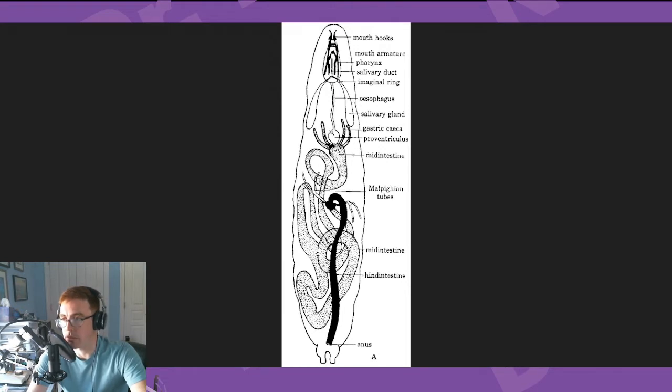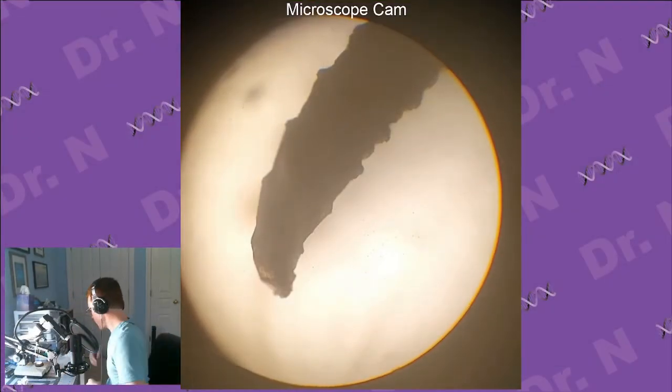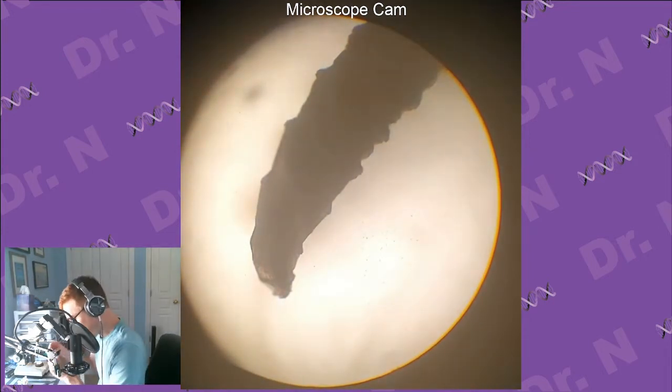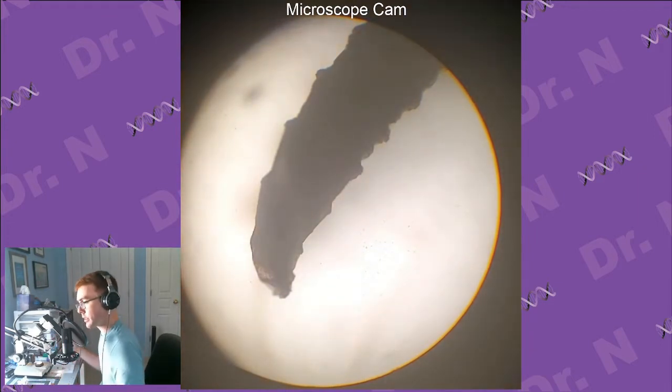So what I'm going to try and do is rip this thing in half, and then I'm actually going to push down from the top, kind of trying to invert the whole thing, so turn it inside out. And then if I can see them, I'll grab out those salivary glands. And then I'll immediately move them to a new slide, which I should probably prepare. And then I'll go from there. So I do have another slide right here ready to go. Yeah, we'll just try it, I guess.